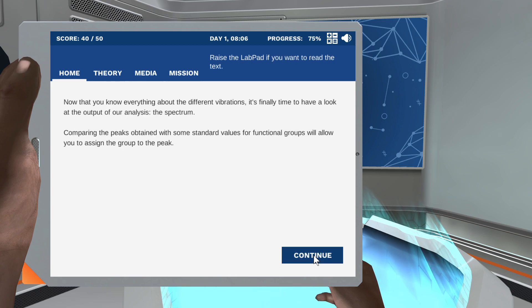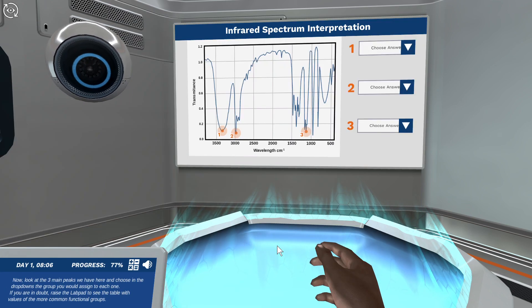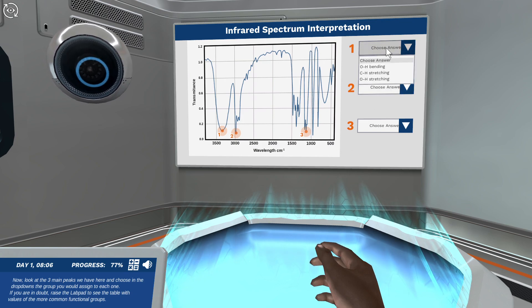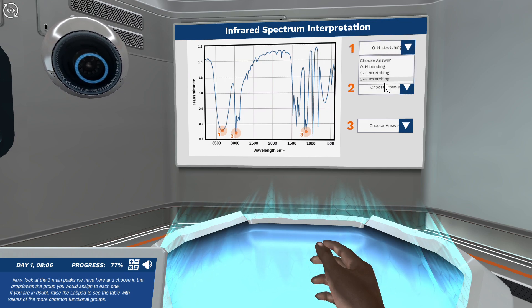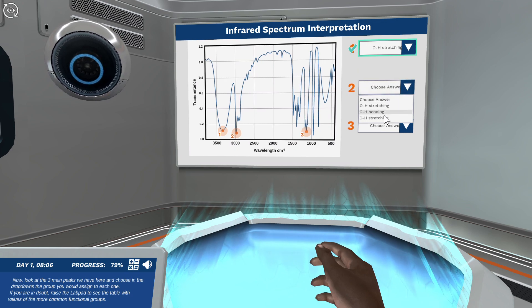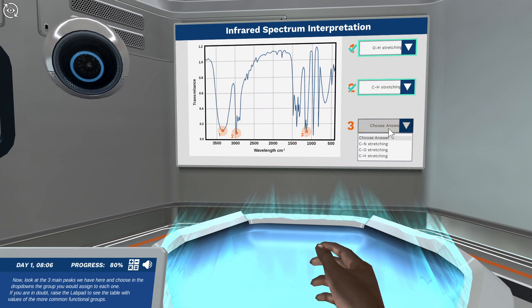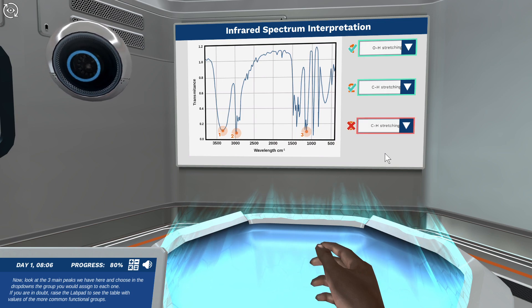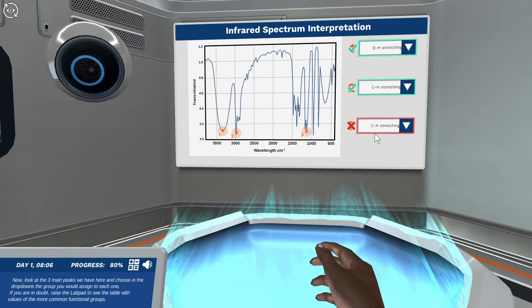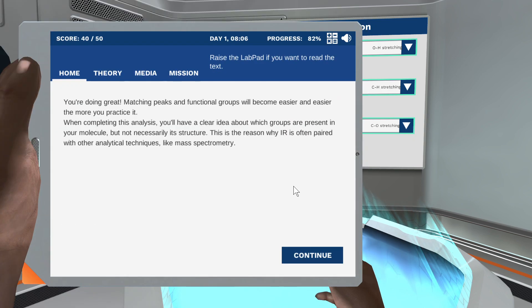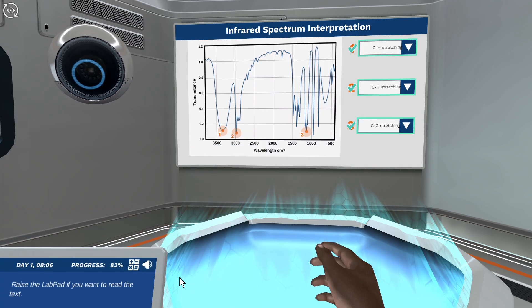Now look at the three main peaks we have here and choose in the drop-downs the group you would assign to each one. You're doing great — matching peaks and functional groups will become easier and easier the more you practice it.